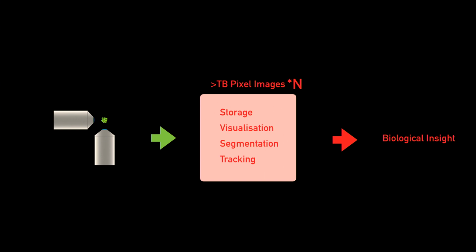So the first thing that comes to mind is: what about image compression? As you previously saw, these images are rather spatially sparse. What compression techniques allow us to do is to bundle up our data set into something small. This really helps us with things such as storage and data transfer. But when we actually want to go back and do processing tasks on this data, we basically have to blow it back up into our original data set.